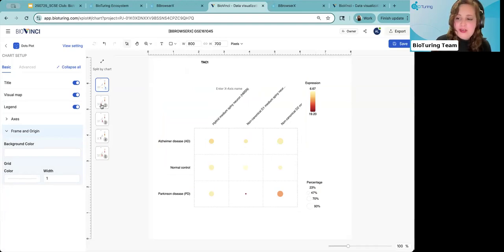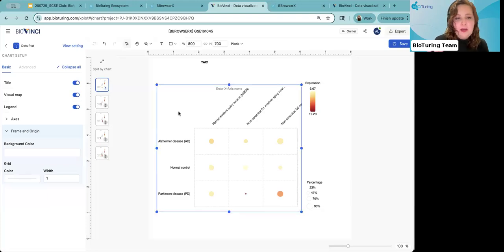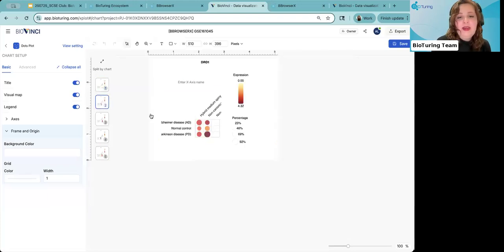How can we search for very specific genes that might have functional shifts within specific cell populations? And can we then export them in a better resolution or adjust the plot so that it's clear, or add color scale changes or change the title, or how we're able to visualize that data in the system?